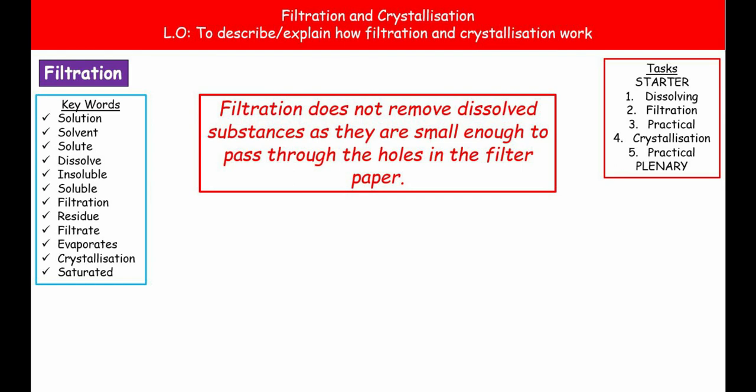So hopefully what we wrote down there is that no, dissolved substances won't be separated out by filtration. They in fact are small enough to pass through the microscopic holes in the filter paper, so they will end up in the filtrate as well. So bear that in mind, filtration doesn't separate out dissolved substances.